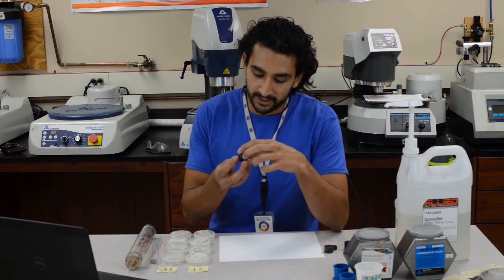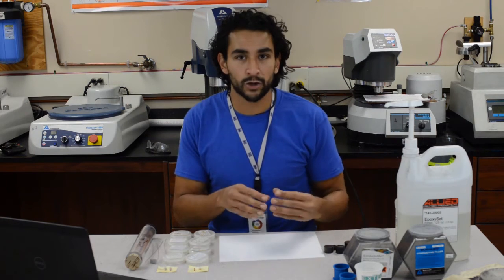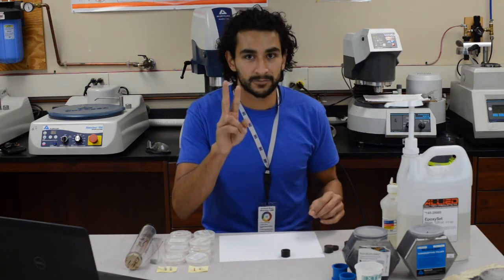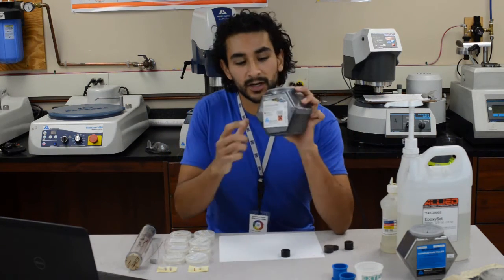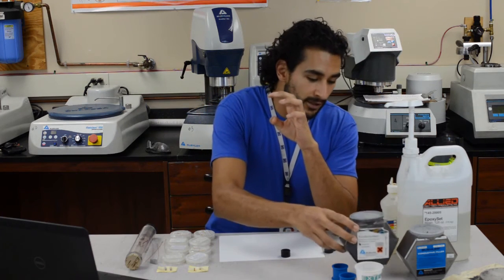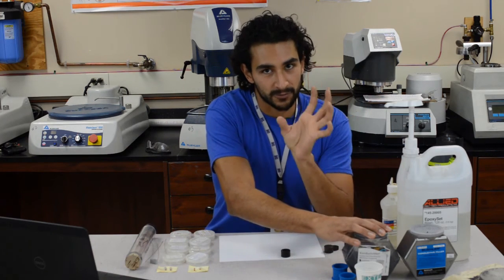Now, thermoset polymers usually start off in the form of a powder or a liquid, and once they're cured under certain conditions, all the polymer chains interlink together and they become really, really hard, just like these pucks right here. In this lab, we use mainly two types of thermoset polymers. We use this one called Conducement — make sure it is Conducement, not some other phenolic resin — and this one requires fairly high temperatures and pressures to cure.